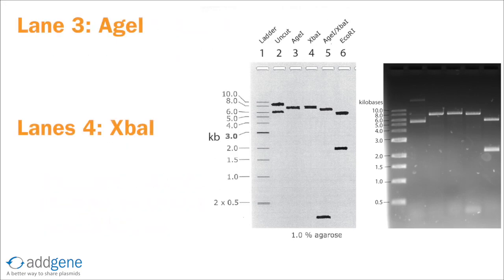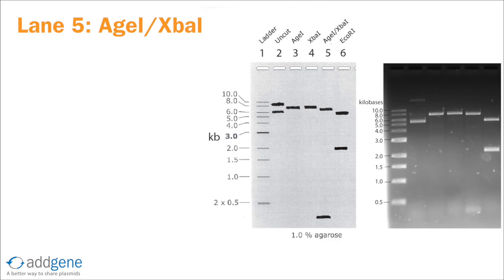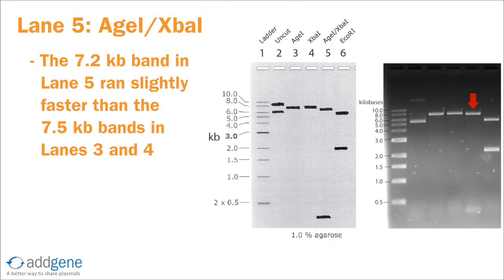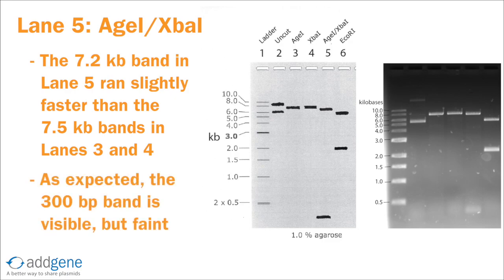Lanes 3 and 4 are the AGE1 and EXPA1 single digests, where we expect a single 7.5 kb band and possibly some uncut fragments. In each lane, we do see a linear 7.5 kb band. Lane 5 is the AGE1/EXPA1 double digest, where we expect two digestion products. We can identify the 7.2 kb band clearly — since this is a new band, we know it must be the 7.2 kb digestion product. Looking for the 300 base pair band, we find that it's visible but faint. From our earlier calculations, we expect this band to be 24 times less intense than the 7.2 kb band, so the band intensity is not surprising.